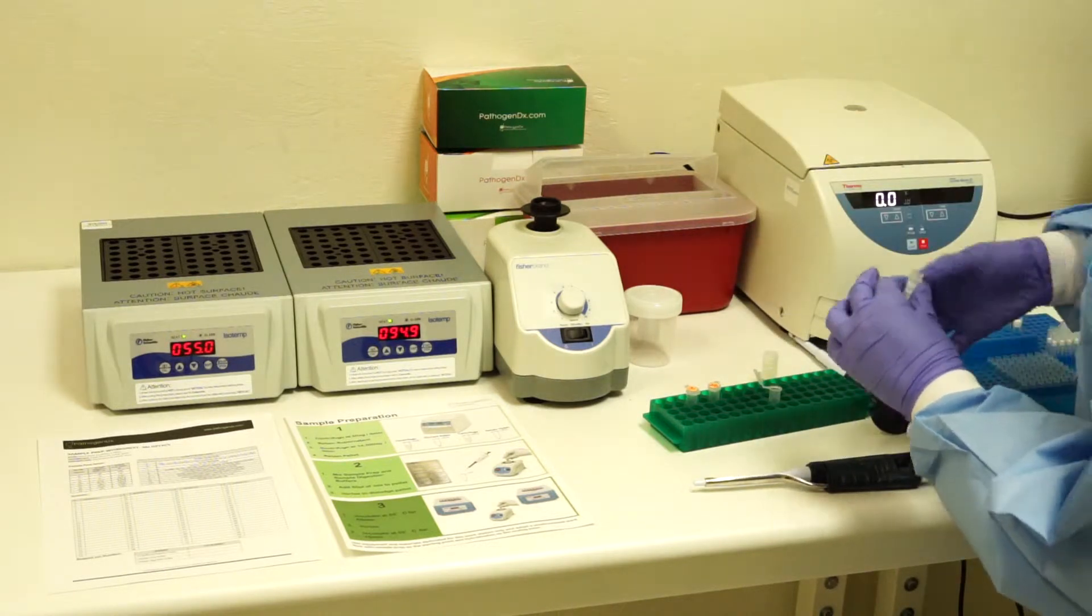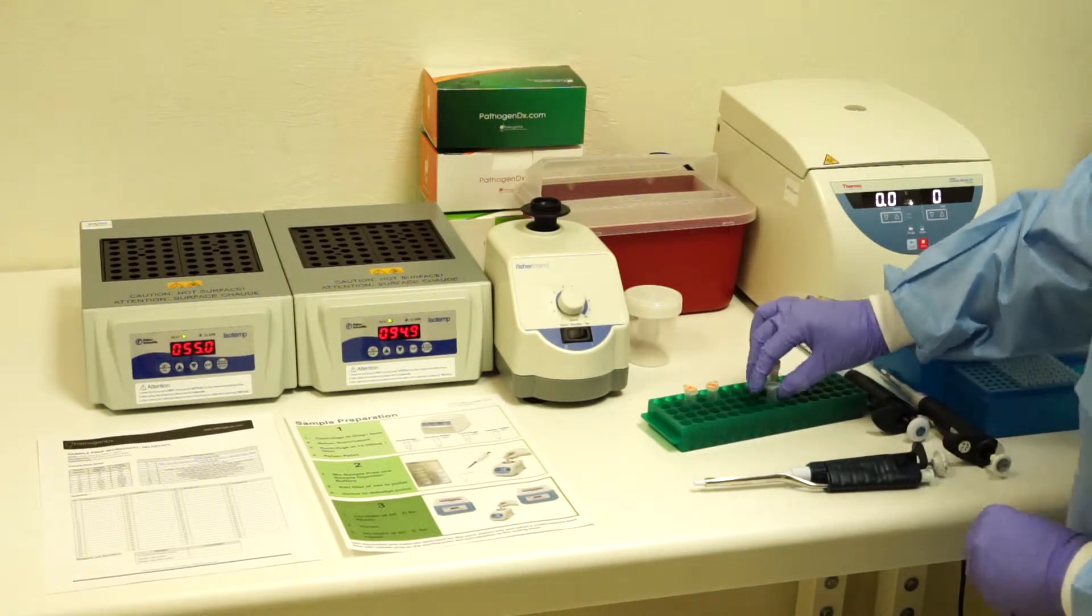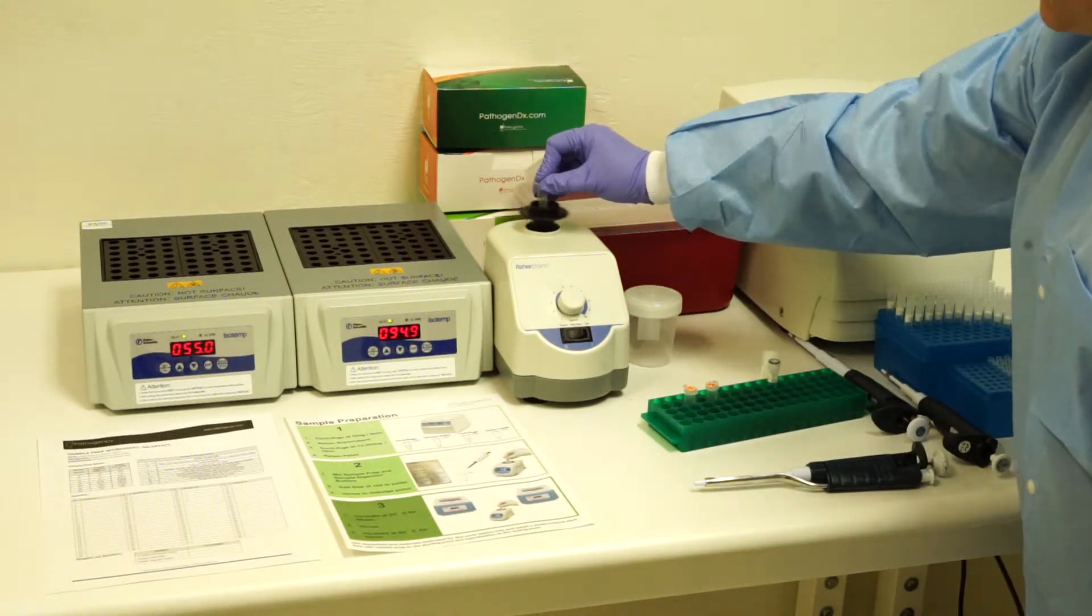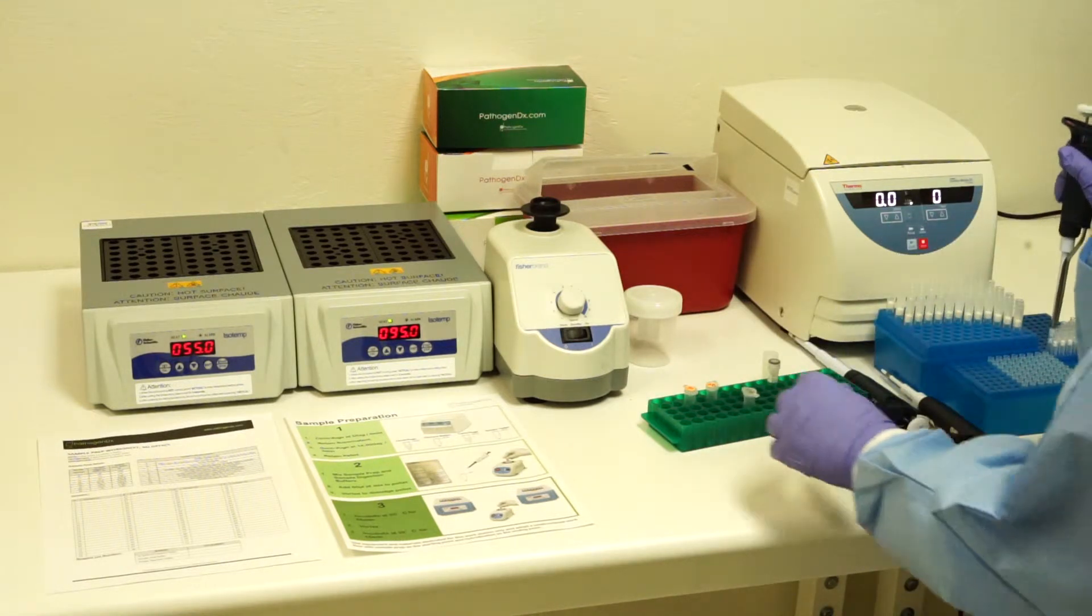Make sure to pipette up and down with the sample digestion buffer. Once the two are combined, vortex to mix. 50 microliters is applied to each sample.